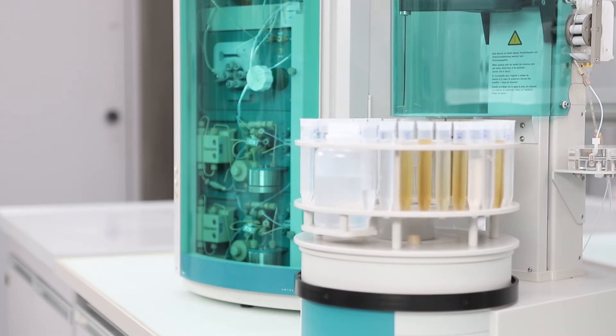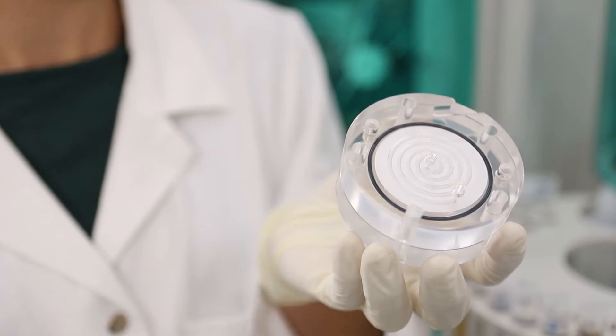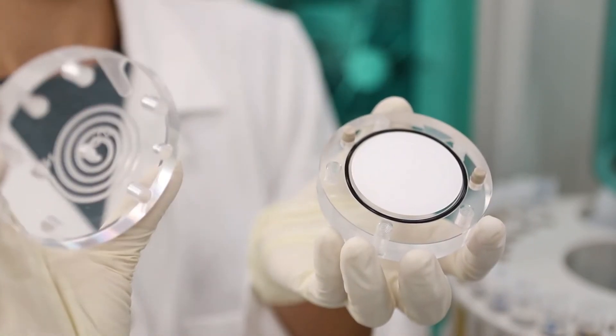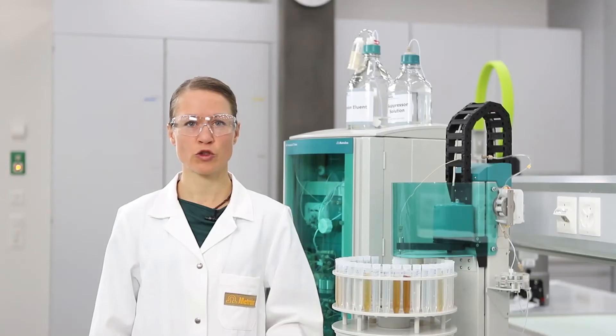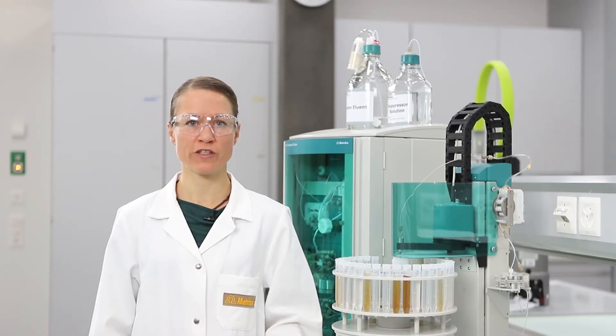The only consumable in inline ultrafiltration is the filter membrane, compared to syringes, syringe filters, and vials which are required in manual filtration. This results in significant reduction of waste and, of course, the cost for single-use materials.